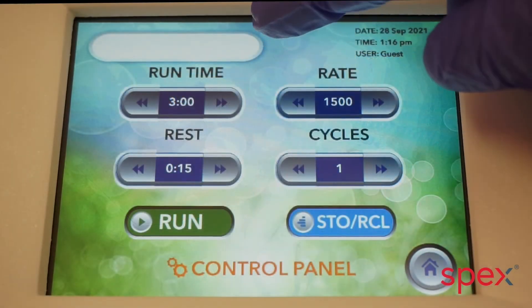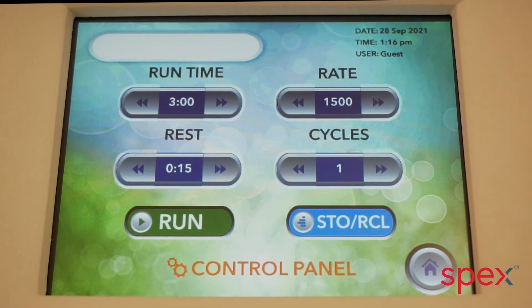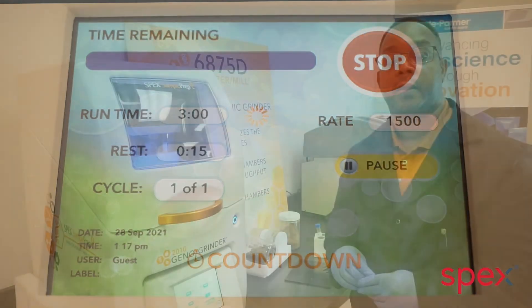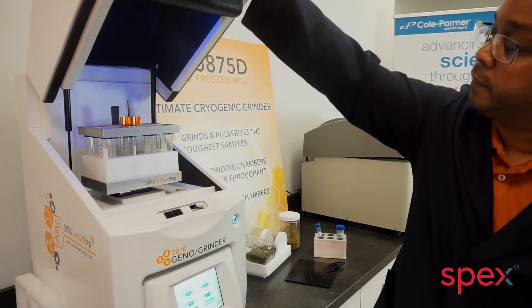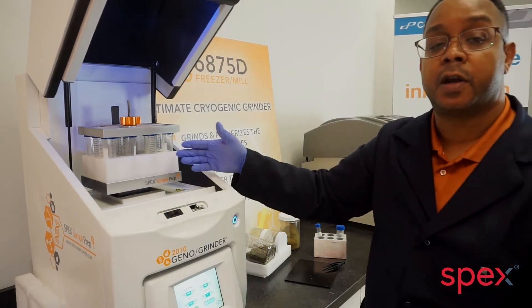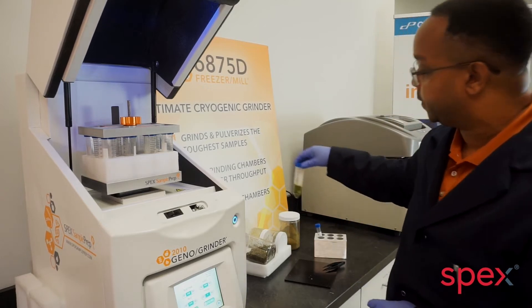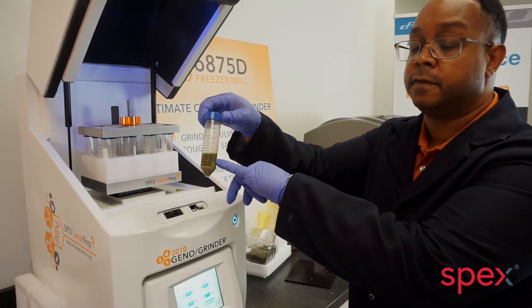Typical run time is three minutes with a rate of 1500 RPMs. After the run time is complete, the sample tubes are removed and centrifuged. The solvent layer is then extracted for analysis.